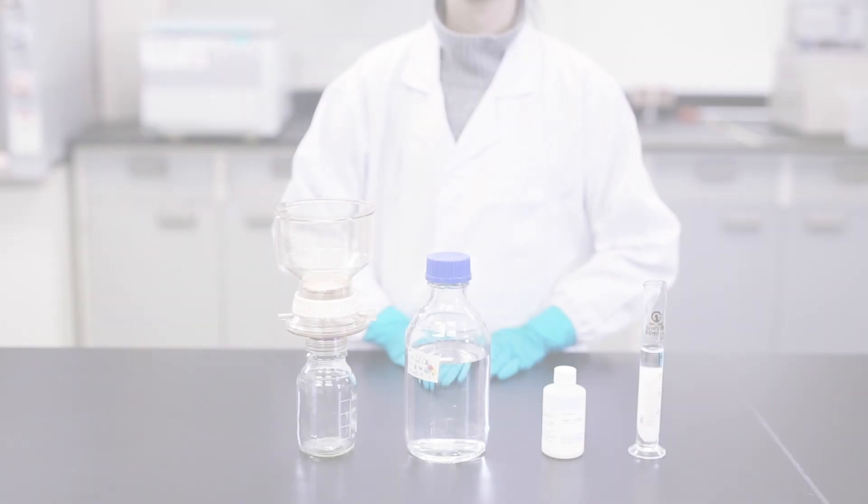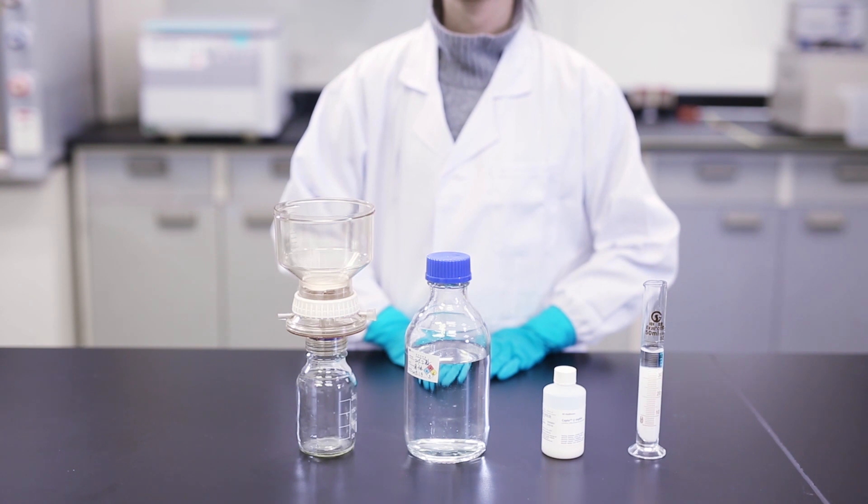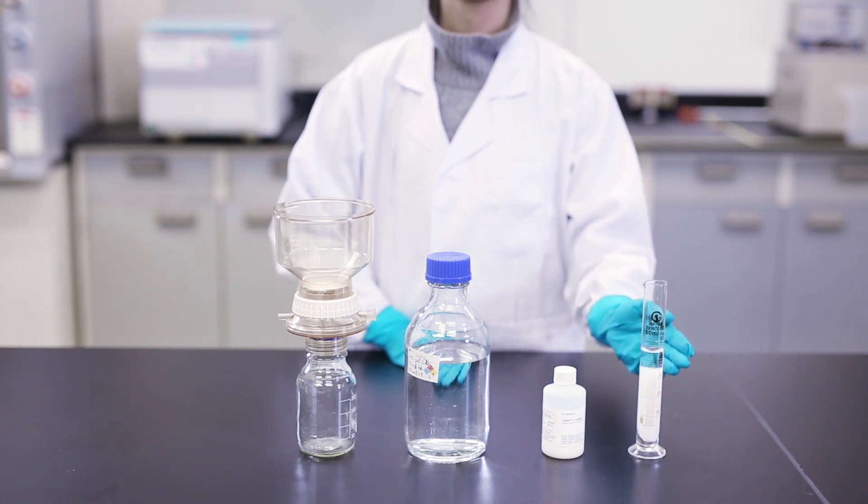Estimate the amount of slurry needed based on the final volume of the column. Most of our resins are delivered in a slurry concentration of 75% in storage solution, in most cases, 20% ethanol.